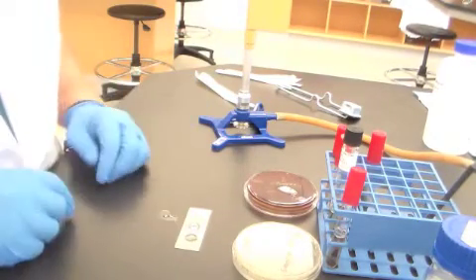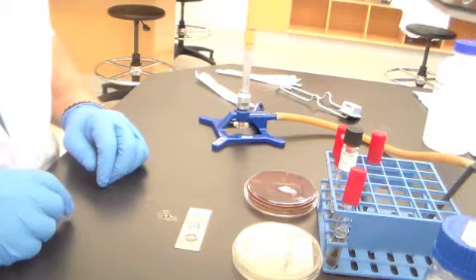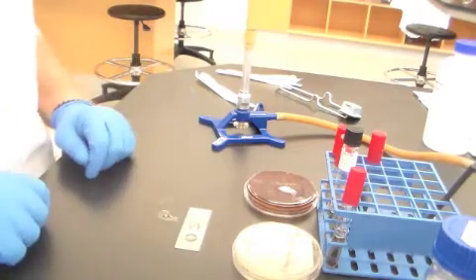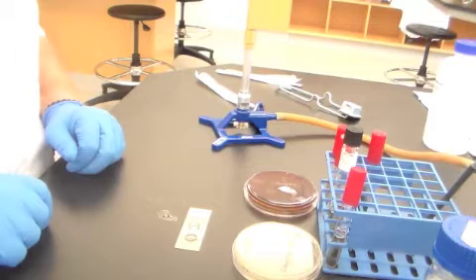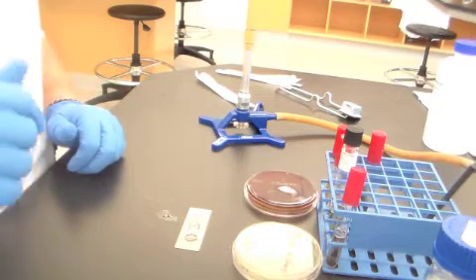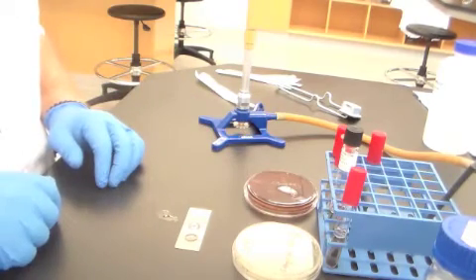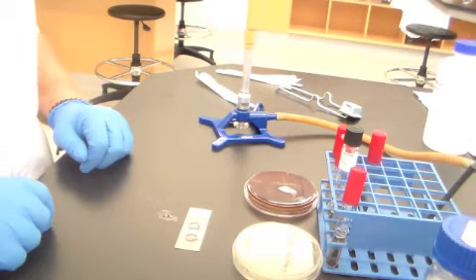And so once you've got your gram-positive separated out, one of the first things that you can do to differentiate is to do exactly this test, the catalase test. If you get bubbling like that from a fresh growth of bacteria, it's Staphylococcus, so it's going to be one of the staph species that we work with. No bubbles, it's one of the strep species. So you've kind of gone a long ways towards identifying your unknowns.